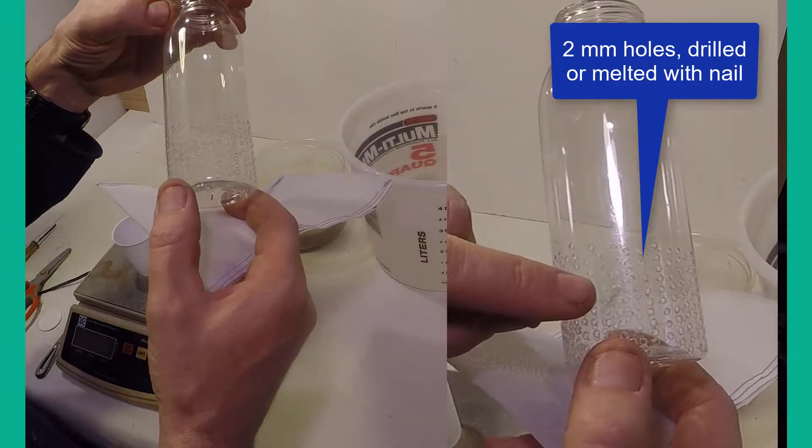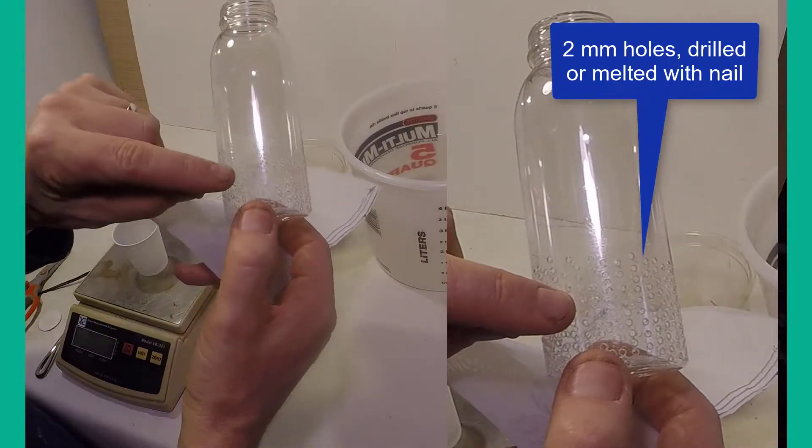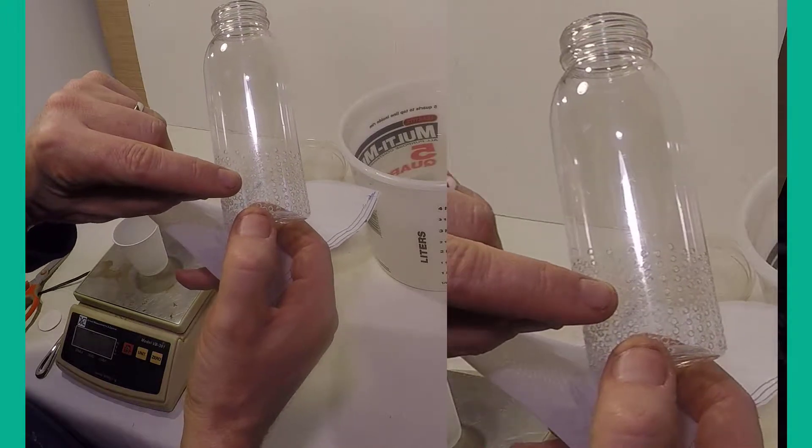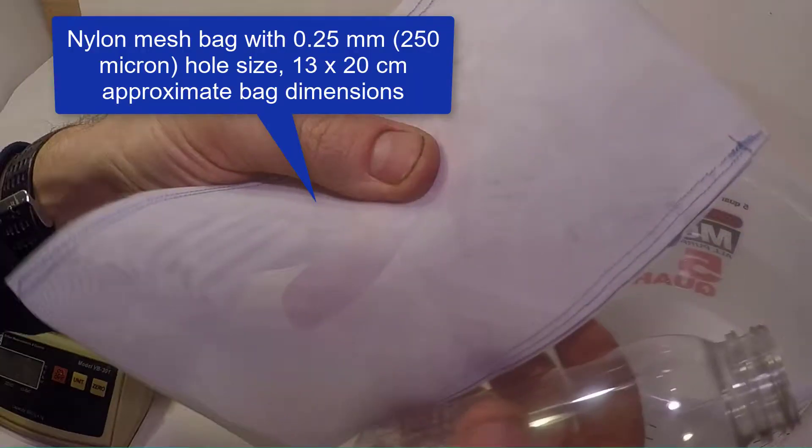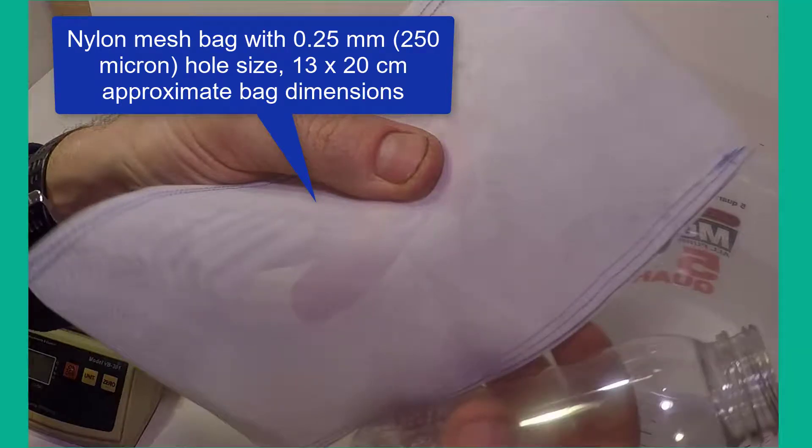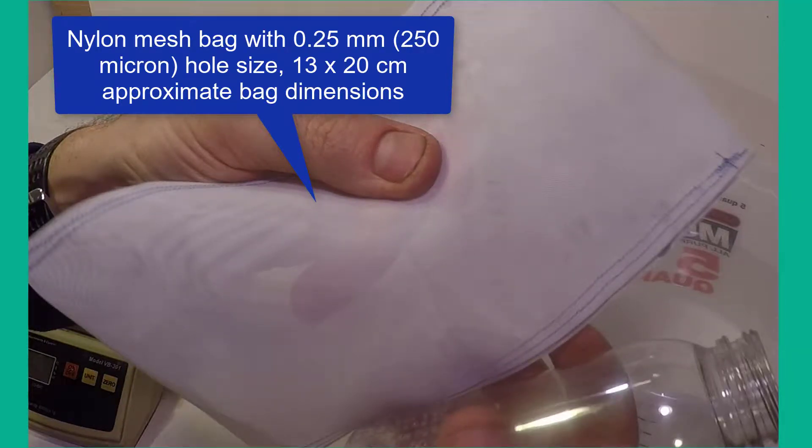For the washing of the soil, you will also need a small plastic bottle with 2-millimeter holes drilled around the bottom. A mesh bag is also needed, sewn from mesh with a hole size of 250 microns.